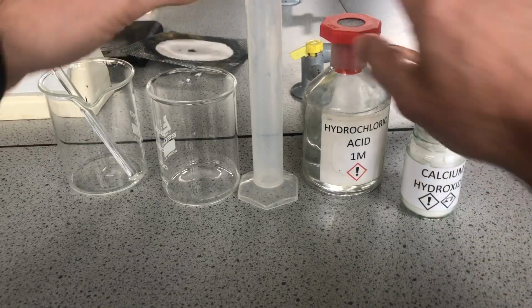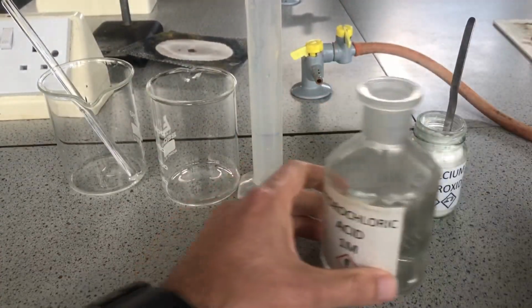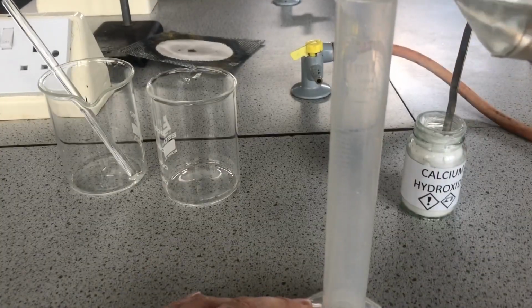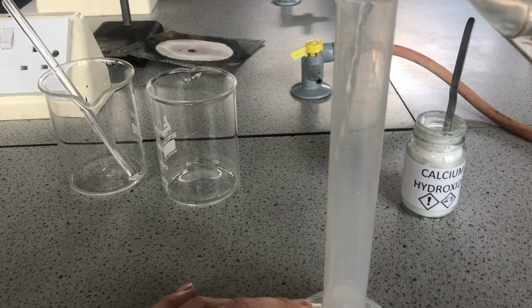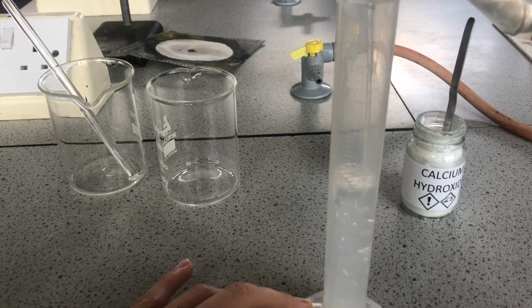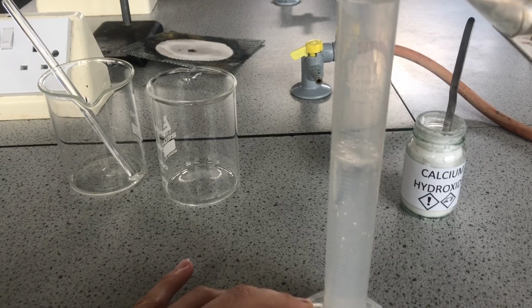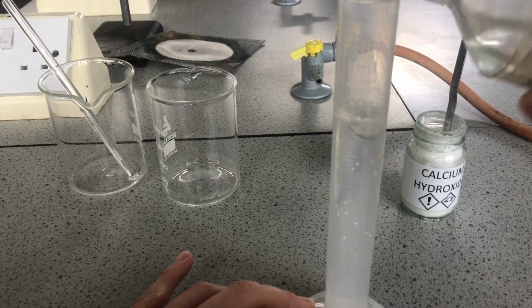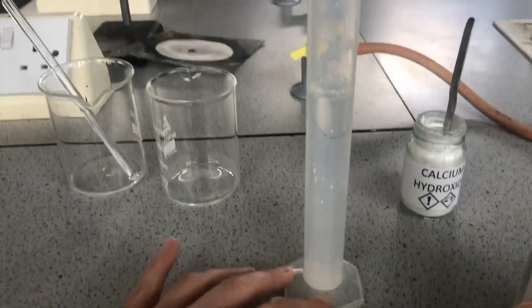We'll start by measuring 50 centimetre cubed of the acid. So pour that into the measuring cylinder, ensure it's up to 50, and we can use a pipette if necessary to take some out if we put too much in, but I'll just go slowly. And I'm happy that's 50 centimetre cubed.